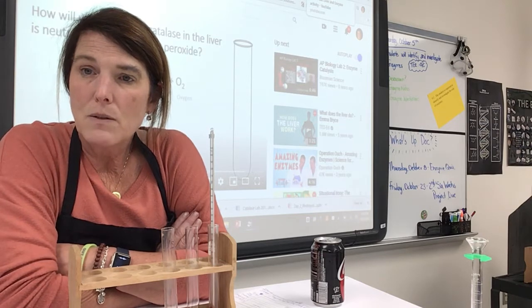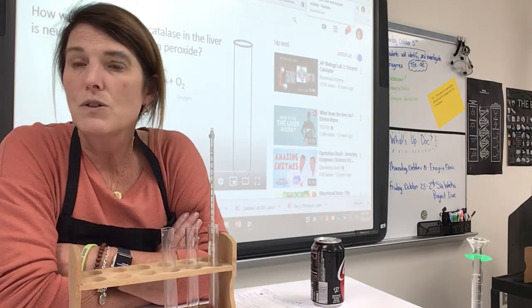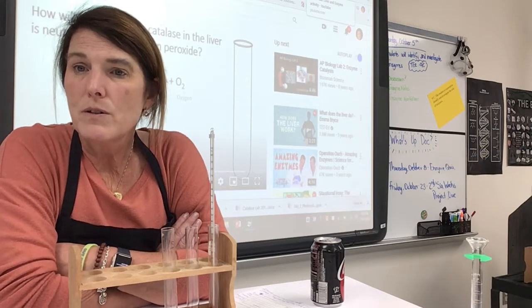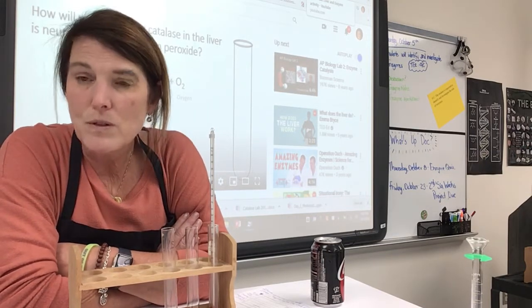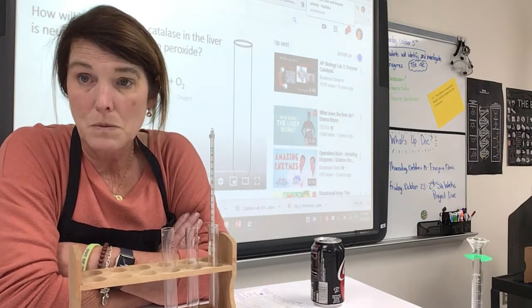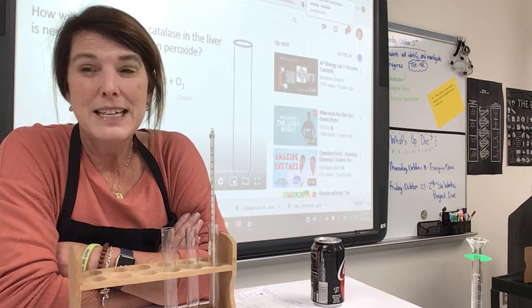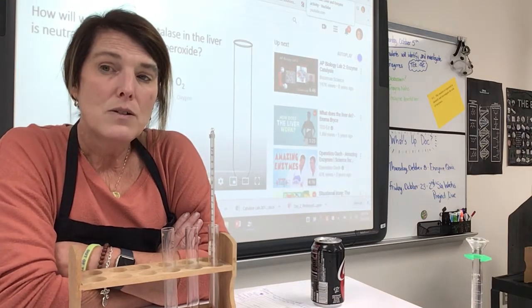So I'll count in my head 20 seconds, and while I wait for it, just to remind you guys, if you were in 8th grade, we knew chemical reactions happened because there were certain clues. City girls love their smartphones, or city guys love their smartphones, is what I often would teach my 8th graders when I had 8th grade. What does that mean? C stands for color, a color change.